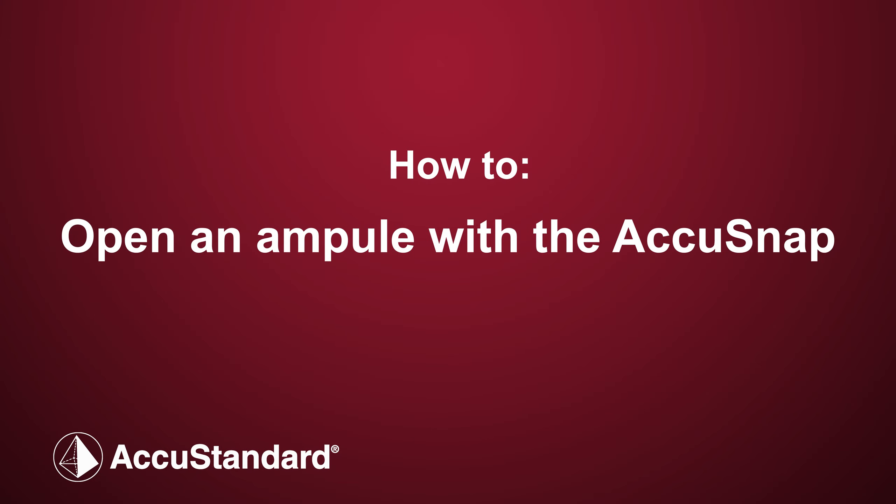How to Easily and Safely Open an Ampule with the AccuSnap. Gently tap the bottom of the ampule to ensure there's no liquid remaining in the head of the ampule.